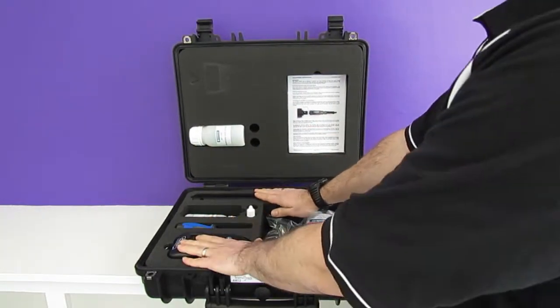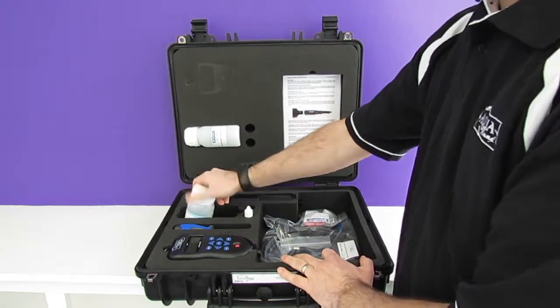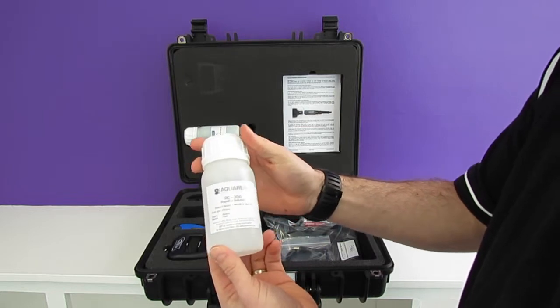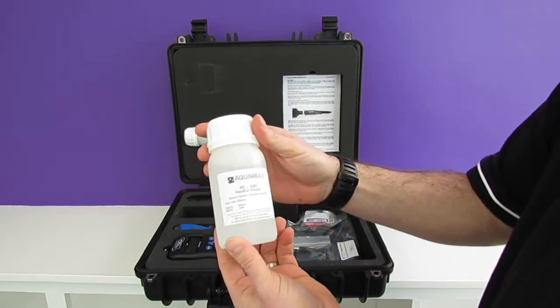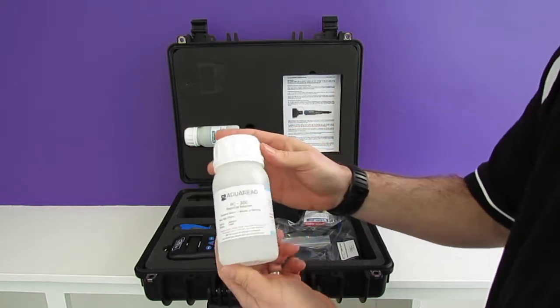In addition to the meter and the probe we also have a calibration rinse bottle. We have a bottle of our RapidCal calibration solution. This will calibrate pH 7, conductivity at 2570 microsiemens, and also all of your optical sensors at the zero point.